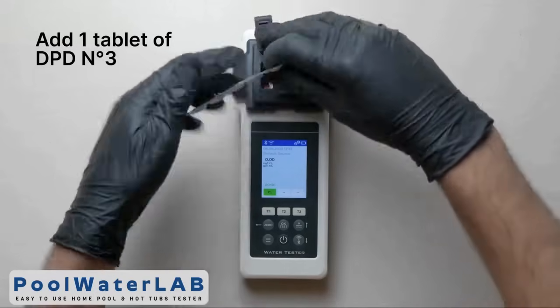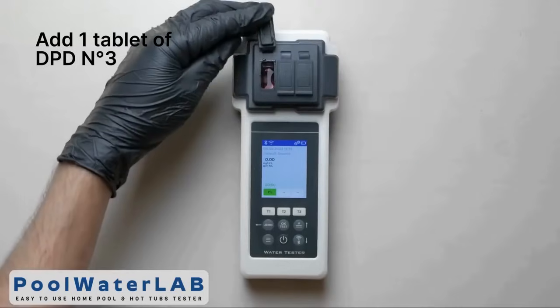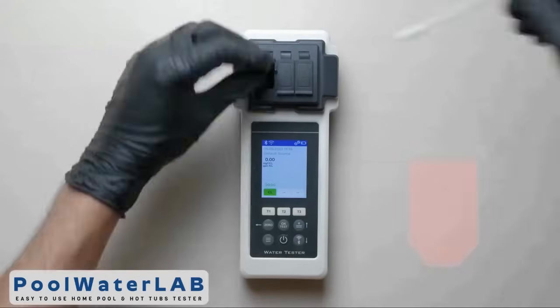Add the tablet of DPT number 3 directly into the same chamber. Don't touch the tablet with your hands. Using a special stirring stick, crush and stir the tablet.